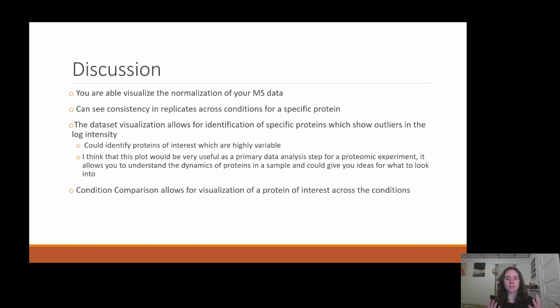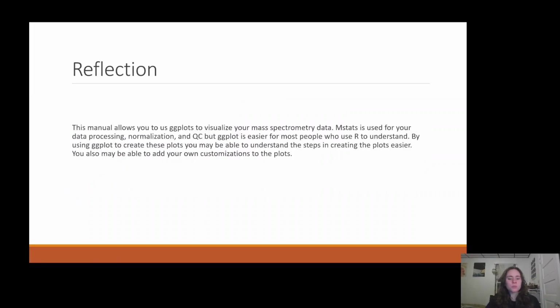And I believe that this dataset visualization is a really good primary step in your data analysis of your proteomics experiment. It allows you to understand the dynamics of the proteins in your sample and might give you some ideas of what to look into. The condition plot allows for visualization of a specific protein across all conditions, which is really useful and could be a next step.